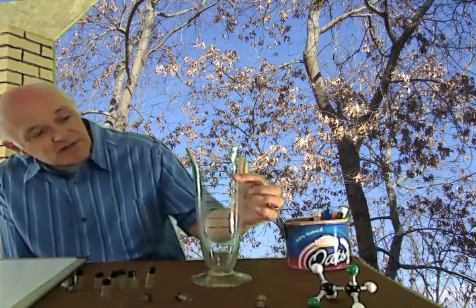We take a liter. This is like a big graduated cylinder. The liter mark is right here. We fill it up. We put in 200 milligrams of 2-methyl naphthalene. 200 milligrams in a liter is 200 parts per million. This implies that there's a million milligrams in a liter, which in fact there is. 200 milligrams is 2/10 of a gram, which is like a spatula full.